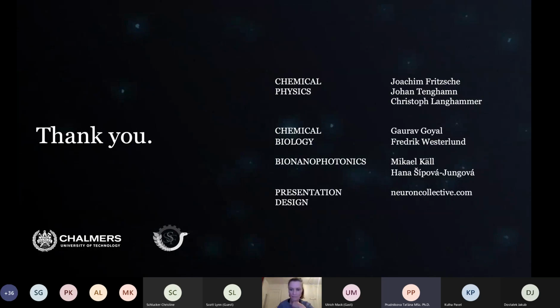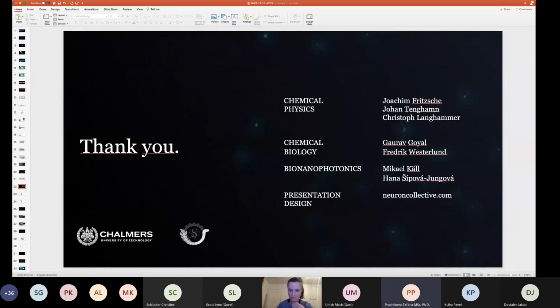What are the limitations of this method? Because from the poster, I know that from 100 kilodaltons up to, let's say, megadalton particles you can observe. What, for example, is the lowest? Well, the lowest we could see now is perhaps a BSA molecule that is like 60 kilodaltons, but that's really at the edge. Yeah, that's the lowest limit in terms of size.